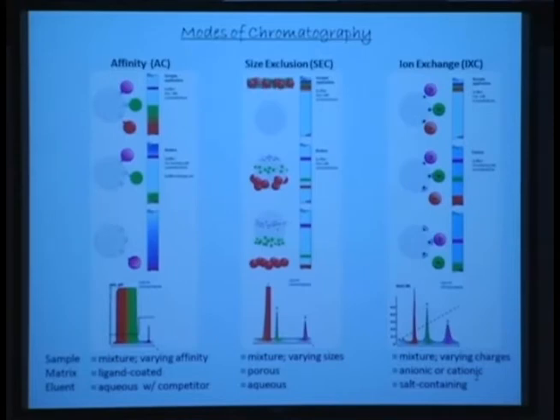This membrane has molecular size pores. So this is not a filtration membrane where you filter particles. This is actually molecular size pores, and these pores determine what molecules can actually pass through from one chamber to the next.